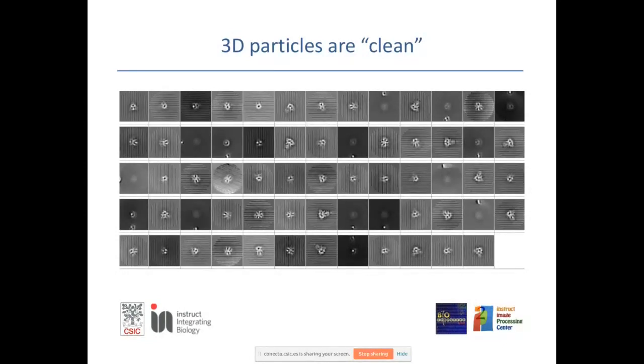But if this 2D information doesn't prevent the 3D alignment, removing those particles from the very beginning might be removing particles too soon. I don't mean that any artifact is fine in the 3D reconstruction, but by taking the decision too soon, you may be rejecting many particles that could be useful.